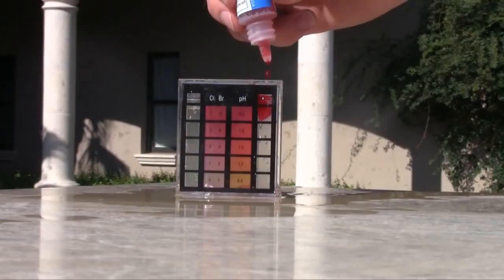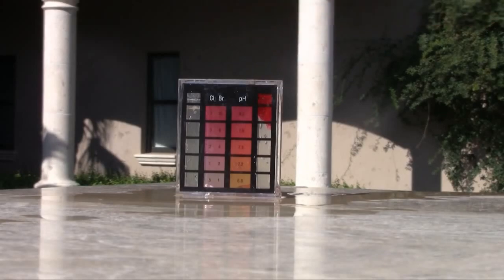When adding reagents to your water sample, hold the reagent bottle vertical to the test vial to ensure uniform drop size and get the most accurate test readings.